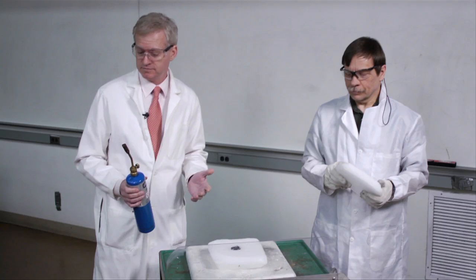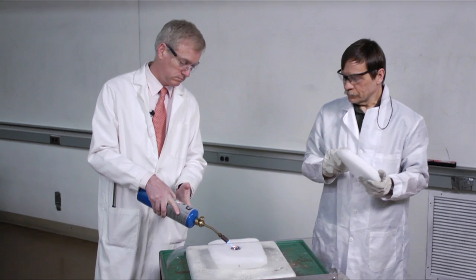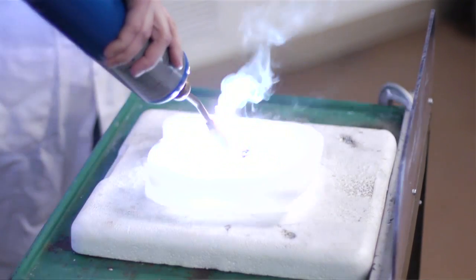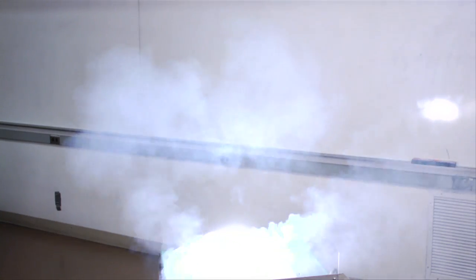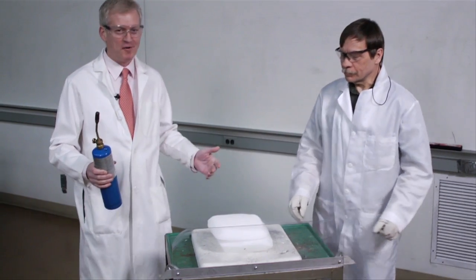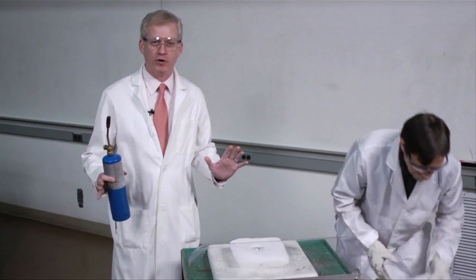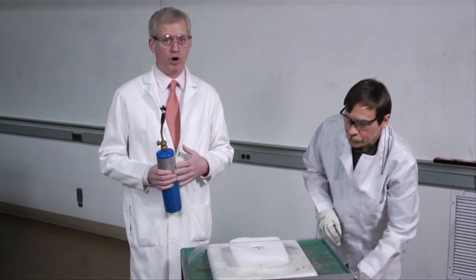Shall we give it a try? I'm now lighting the magnesium turnings. And, they're off. Wow, did you see that? Once the dry ice began to serve as the oxygen source, it lit up brilliantly. And the heat caused some wonderful sublimation and condensation of water vapor in the air.